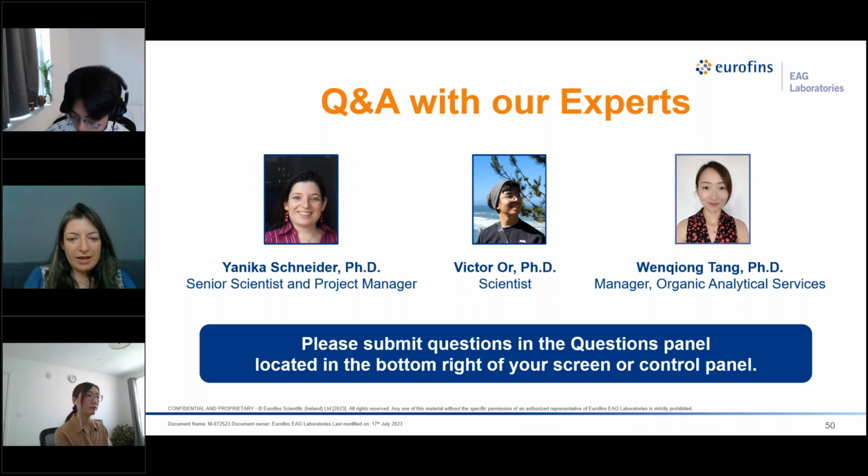Thank you. And a quick follow-up to that: how flat should the surface be for NanoIR? What kind of surface roughness can you live with? I would say ideally we would want height steps of a maximum of 5 or so microns. If it's too tall, then you can imagine that it might attenuate or block the IR from reaching certain features in your sample. But of course, with these AFM-based techniques, the flatter you can get the sample, the better. And we have a lot of service lines that are dedicated towards sample prep or polishing if needed.